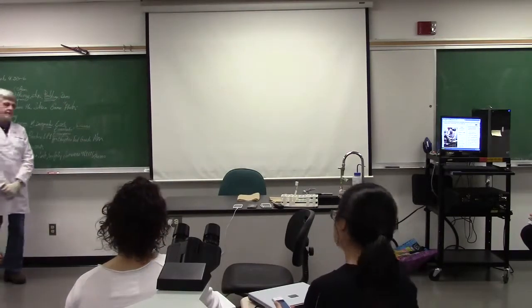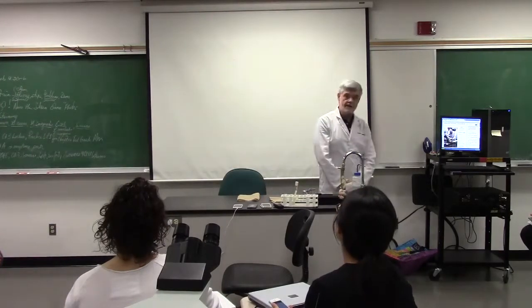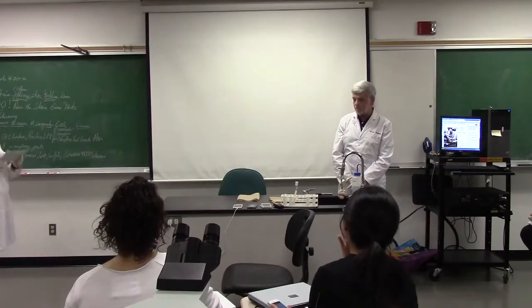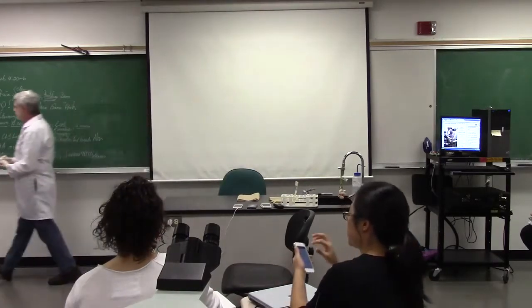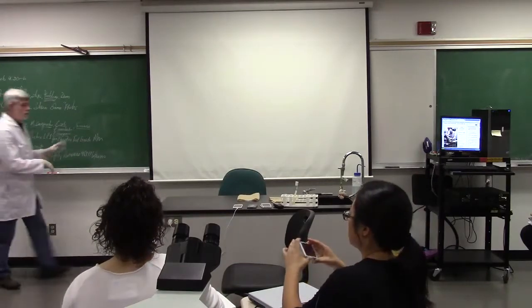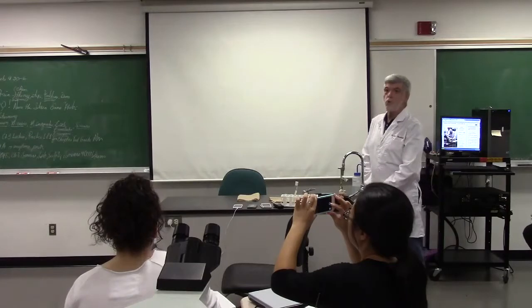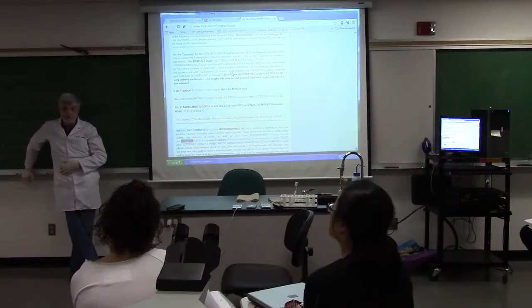In the pop quiz, there's going to be questions about the theory of each stain, the chemistry of each stain, and interpretation of results, things you see under the microscope. One of the places you should go is, on the website, under smears, there's a long study sheet for Lab Practical 1 just before you get to the smear.